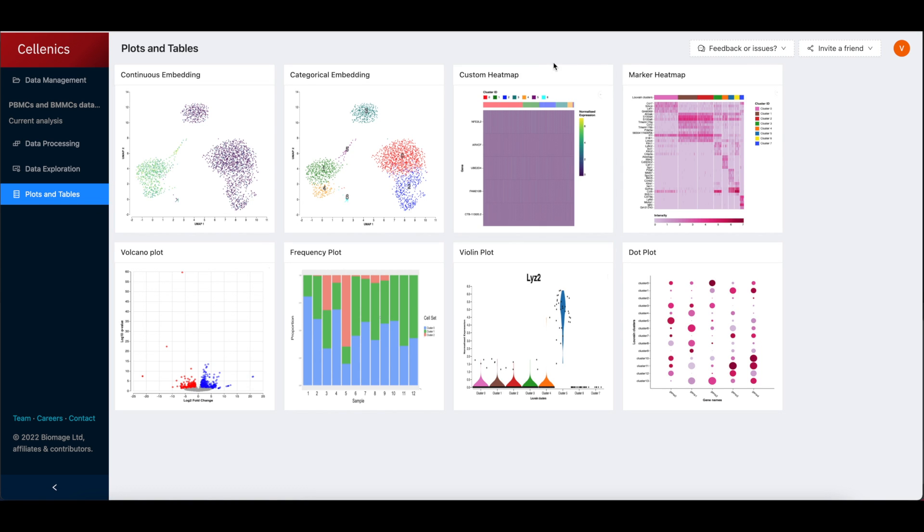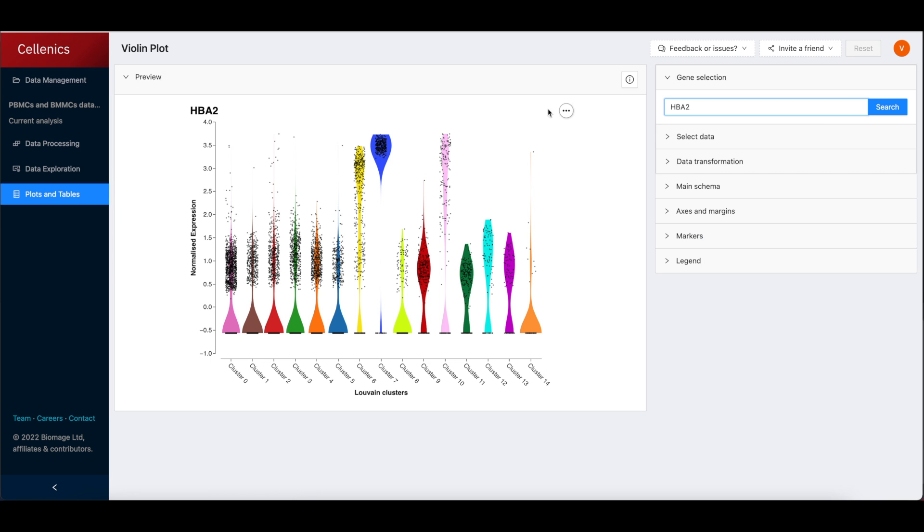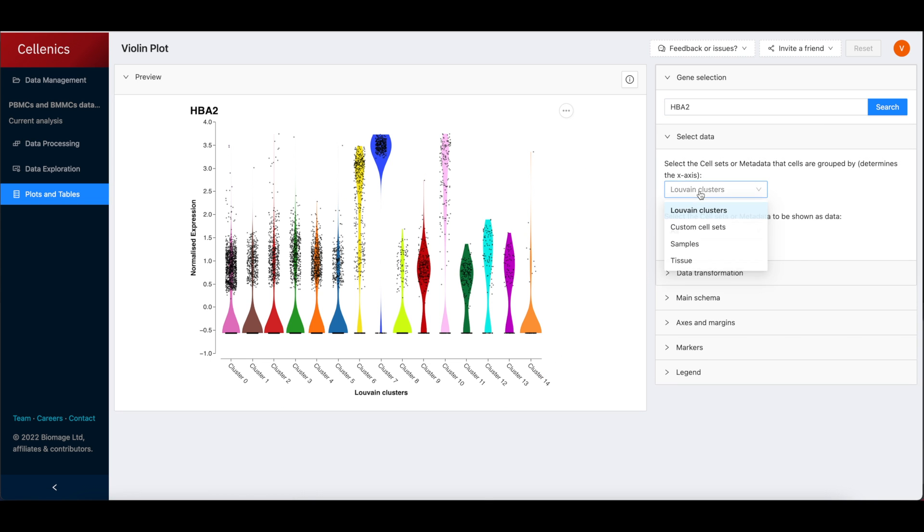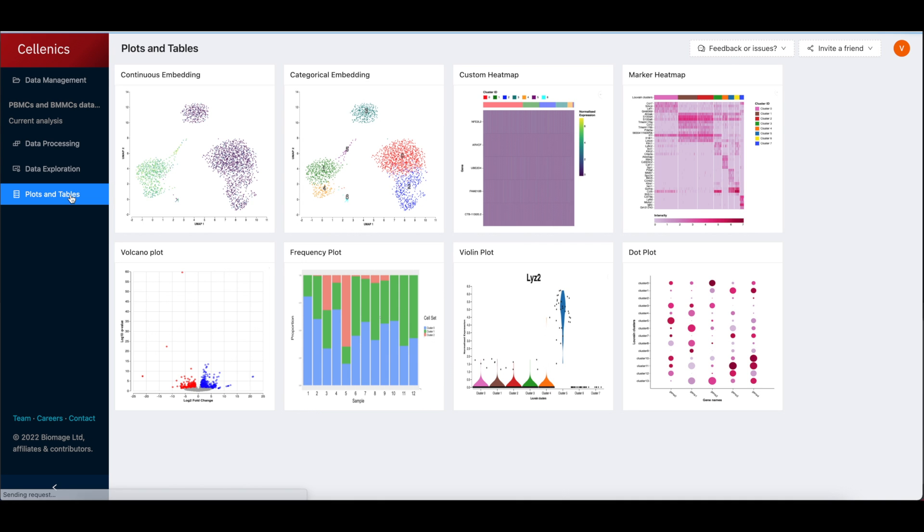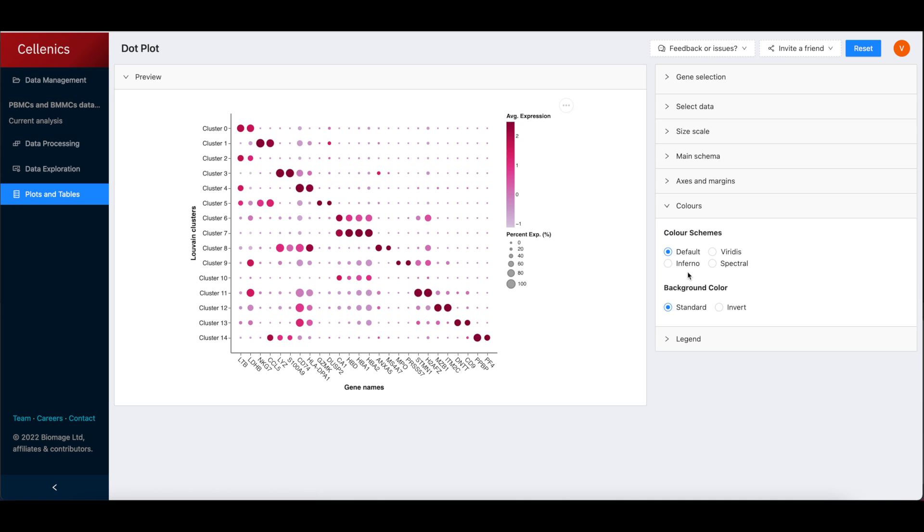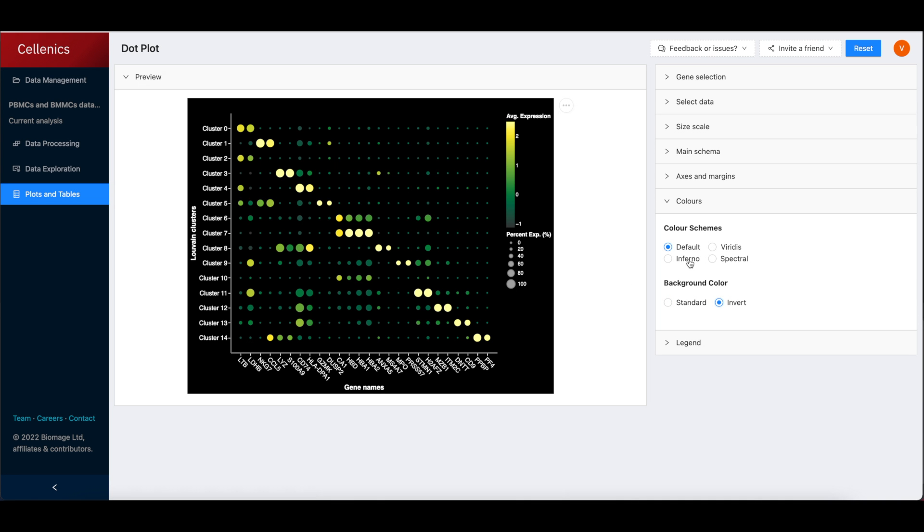These plots can be exported as high-resolution figures ready for publication. Further types of plots including trajectory analysis are in development and will be available soon.